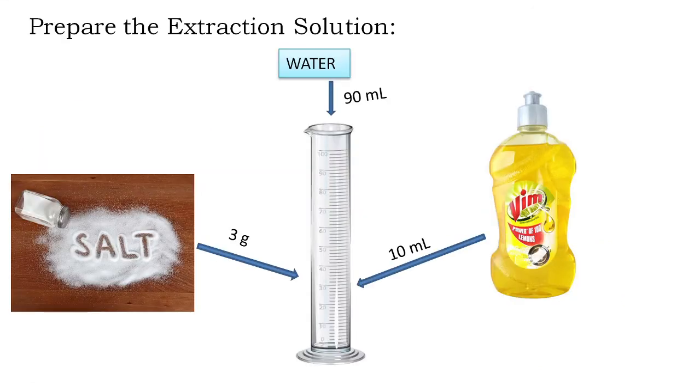In the first step of the experiment you have to prepare the extraction solution or the extraction buffer. The extraction solution contains 10 ml of liquid detergent or liquid dish soap, 3 grams of salt, and 90 ml of water. You mix these components and you get the extraction solution.